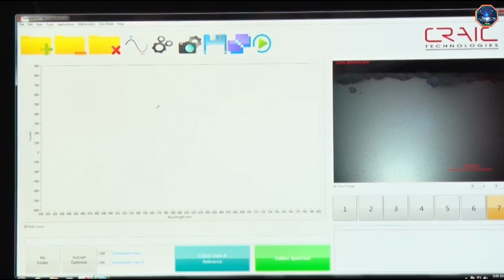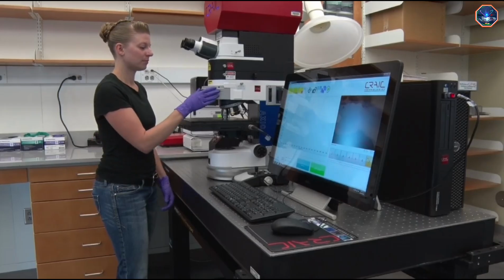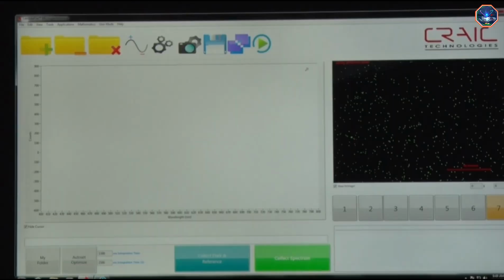The features we see at the top of the image are chips on the edge of the silicon wafer, and if you look closely, you can see some small dots on the wafer. Those are the nanoparticles. Now, I'll switch to dark field reflection mode. In this mode, only light that has been scattered will be collected by the objective, and it will be much easier to see the nanoparticle scattering.